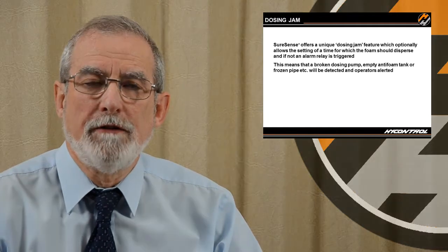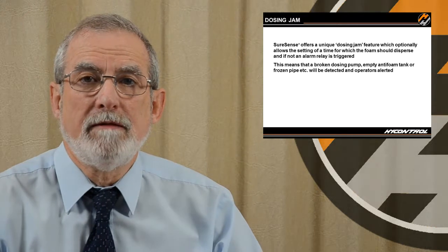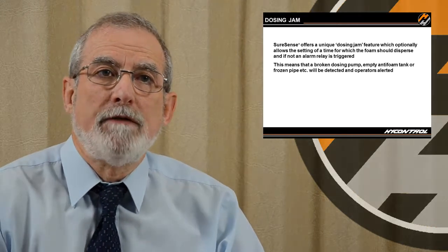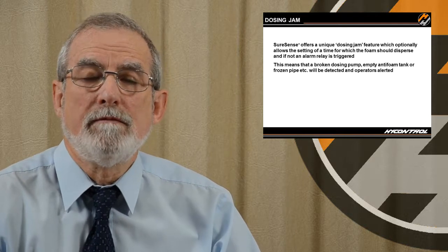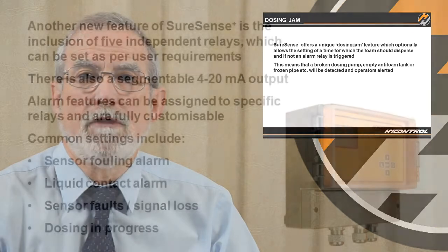So if we're measuring foam and we expect to get it under control by a certain time, we could set 5 minutes, for example. If the foam is still out of control within 5 minutes, we can use the jam alarm to create an alarm, and it will tell us that something's gone wrong.